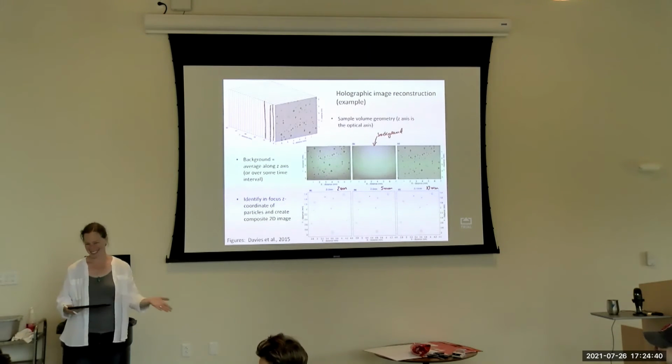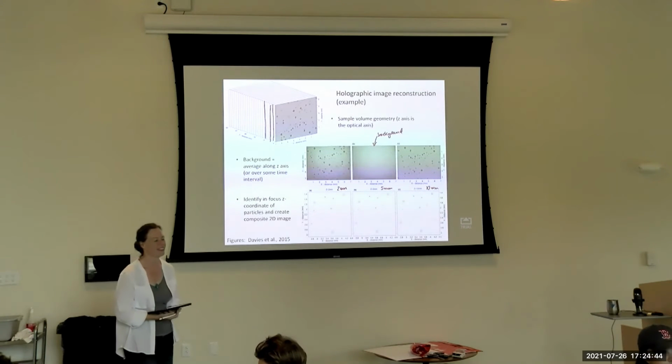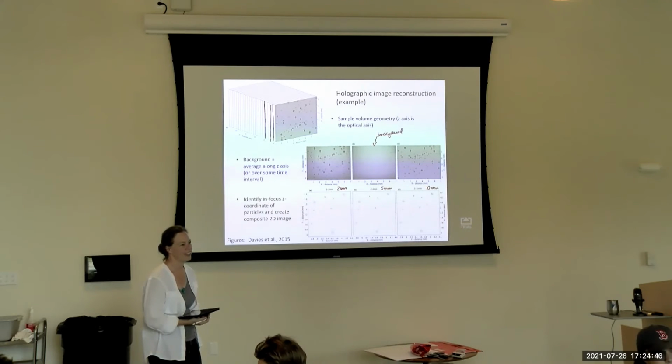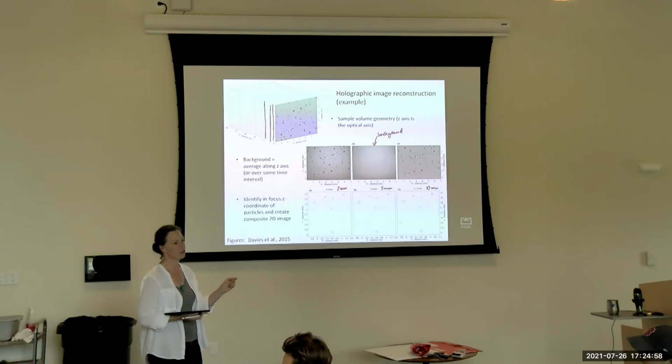But yes, to answer your question, I guess. So is your delta Z, or your Z step, limited by the integration time of the sensor, or is it based on the amount of light that you need? Like how closely can you space your... Yeah, I think it probably has to do with the image resolution, right?